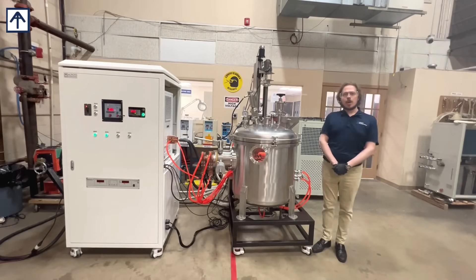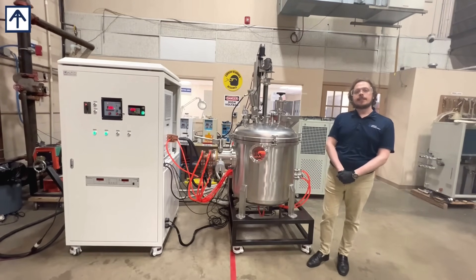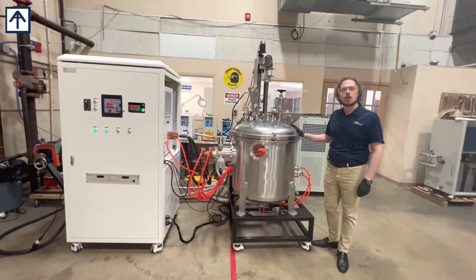Hello, this is Maxwell with ACROSS International, and we're at the ACROSS International New Jersey induction heating testing floor where we have our 10 kilogram vacuum induction melting system.